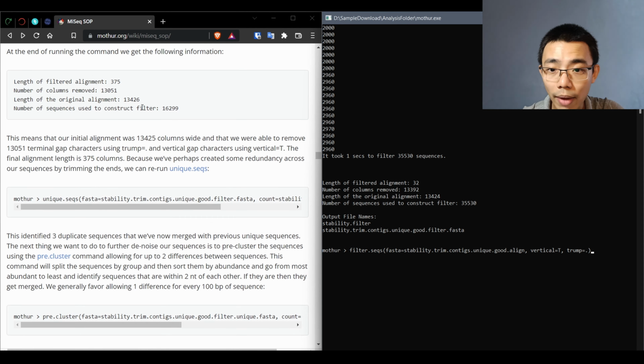And here they're using the reference train set, which actually contains more taxonomy information for all the alignments and sequences. So for my understanding, the SILVA is for the sequences for you to align to, while the train set here contains the taxonomy information. I'm happy to be corrected though. I can't find a lot of information here.